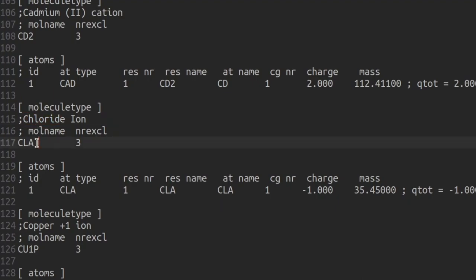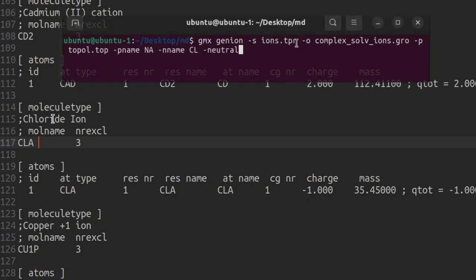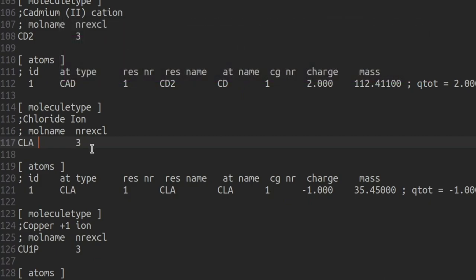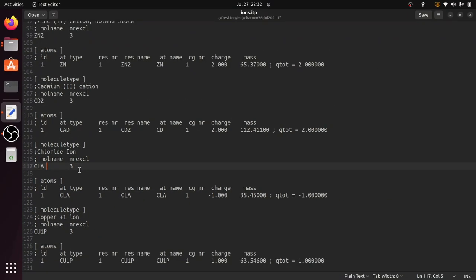For the chloride ion, you can see the name is CLA. But in the previous video, we used the July 2021 force field and gave the names as NA and CL for the ions when adding them. So in the coordinate file, the NA and CL names will be present, but this ions.itp file will have SOD and CLA as the respective names.